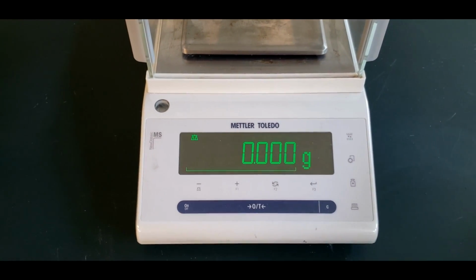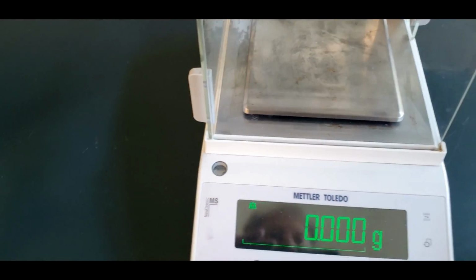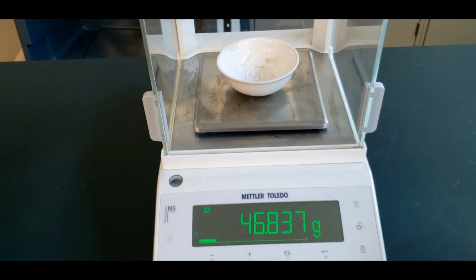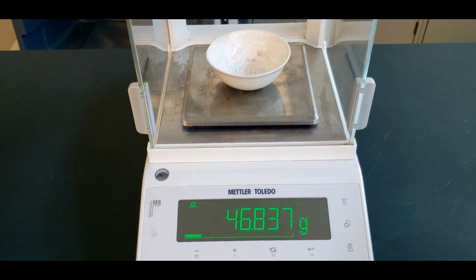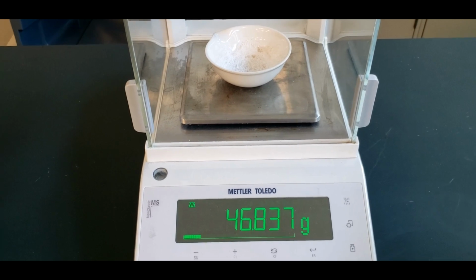And the last data point is going to be the mass of the evaporating dish plus the dry salt. And with that, you have all the data you need to determine the masses of each of the components and the percentage of each in your mixture.